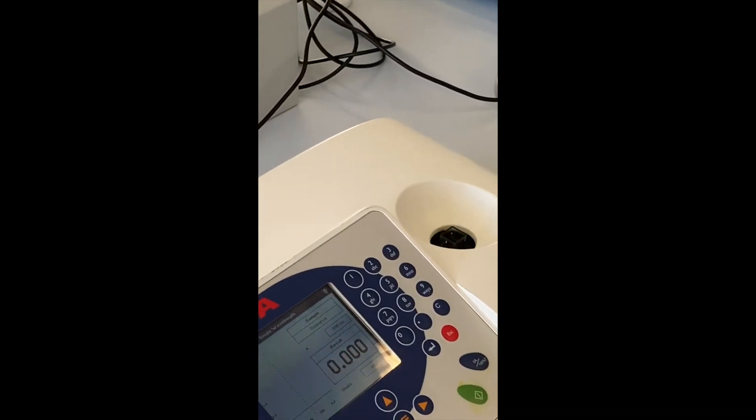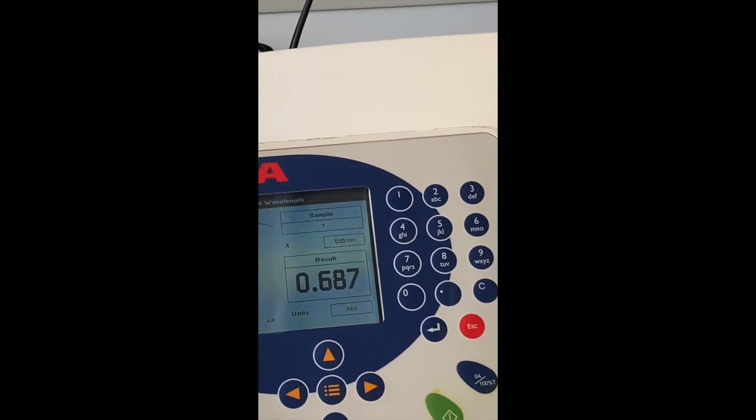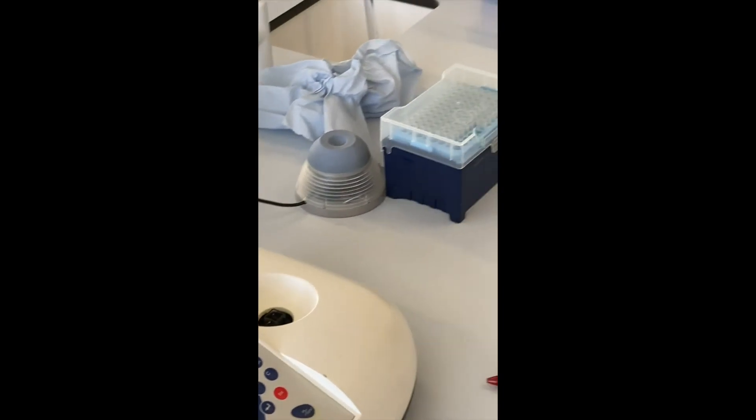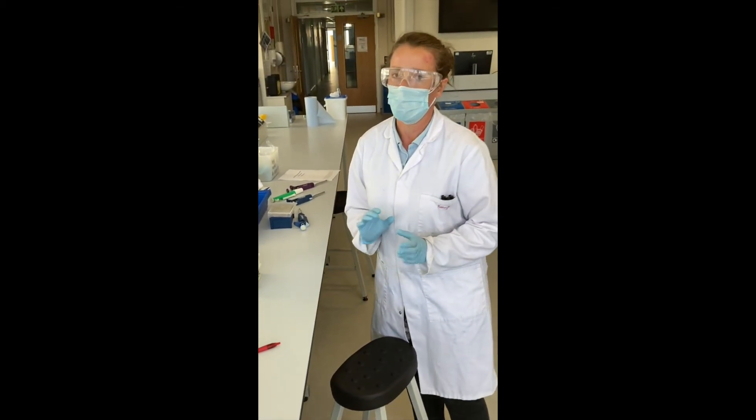The readings on the spectrophotometer should always read between 0.1 and 1. If they ever exceed or go below this, there's an issue with either your sample or your blank, so you'll need to double-check what you've done wrong.